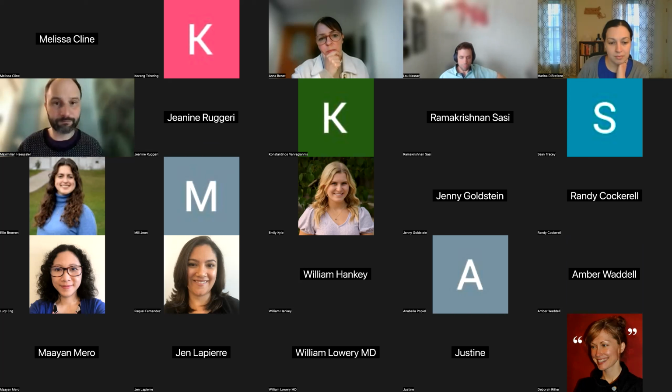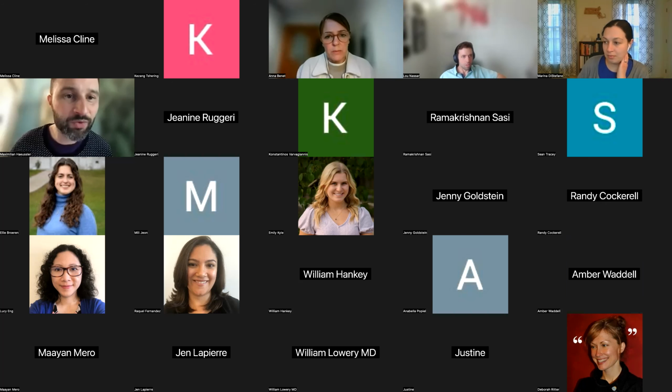But yeah, the separate question was on the cancer hotspots, which is a completely separate data set from the expert panel definition of hotspots. Yeah. The cancer hotspots are really easy to import. I agree. We can look into that. We have Cosmic, by the way. So yes, that is kind of the same thing, I guess, but without an easy list.